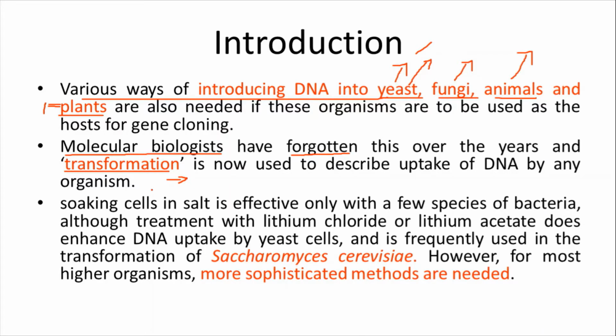So a lot of techniques are needed, and scientists jumped into sophisticated methods for gene transfer into the host. Here, sophisticated methods means microinjection, electroporation, and the gene gun method.